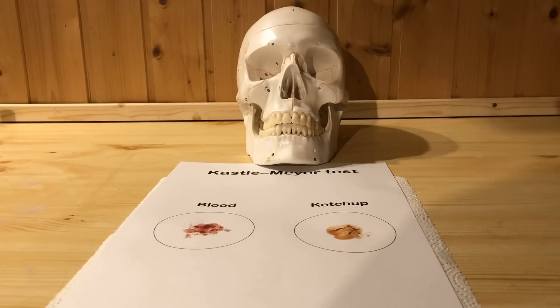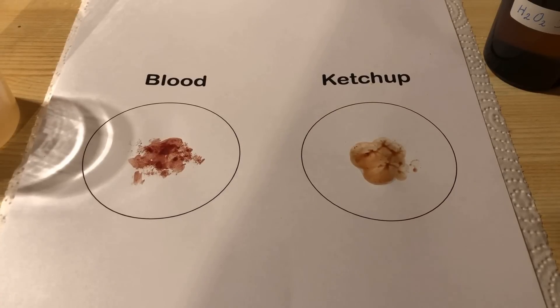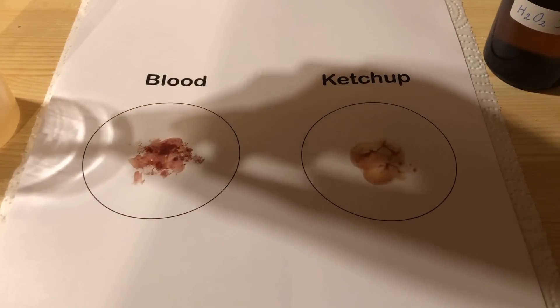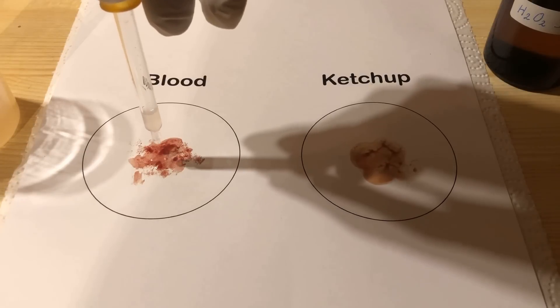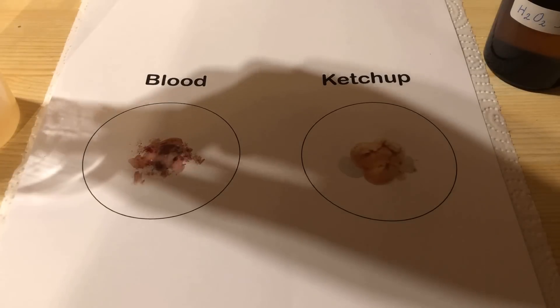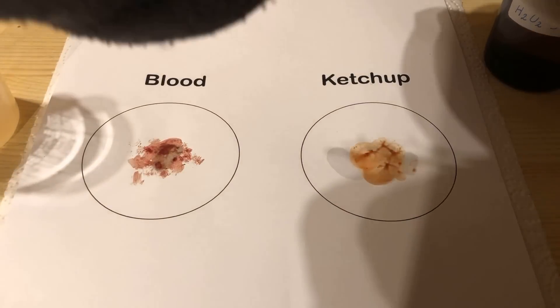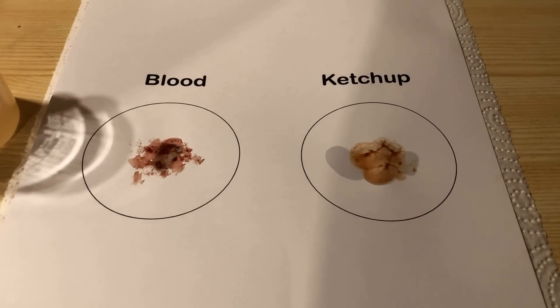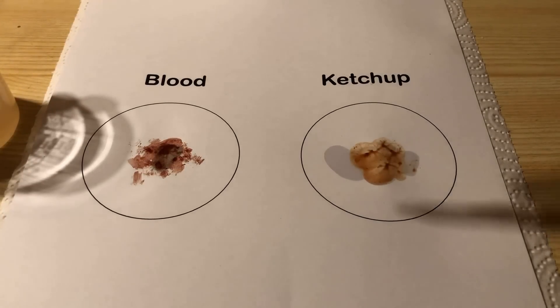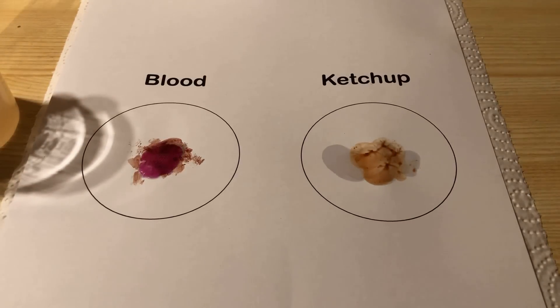Now we need the paper with the blood sample and the blind sample — also known as ketchup. A few drops of the reduced phenolphthalein-ethanol solution are applied to both samples with a pipette. Then, using a second pipette, some of the 3% hydrogen peroxide is applied onto both samples. The typical pinkish-purple coloration appears immediately in the blood sample, but not in the ketchup.